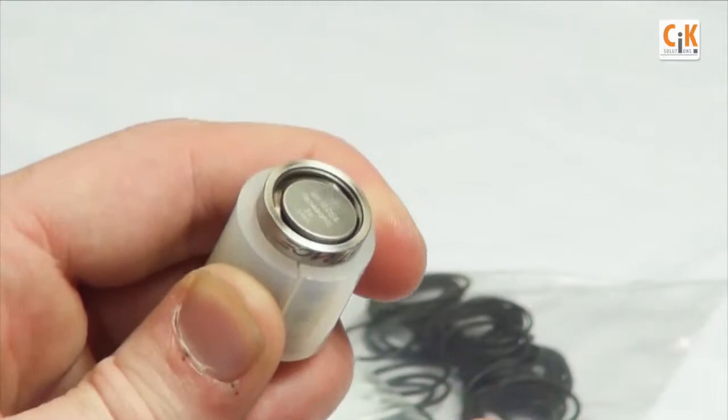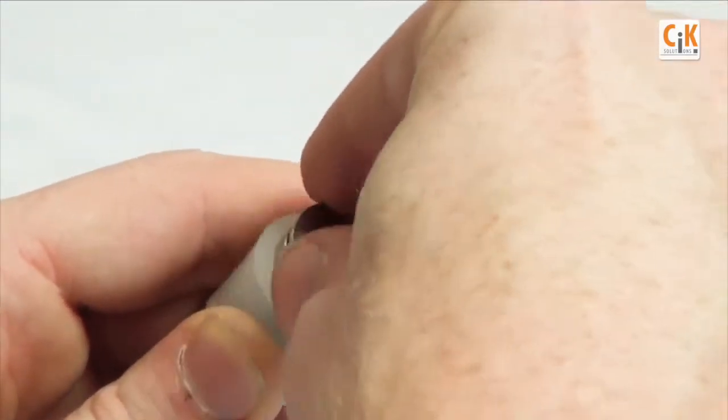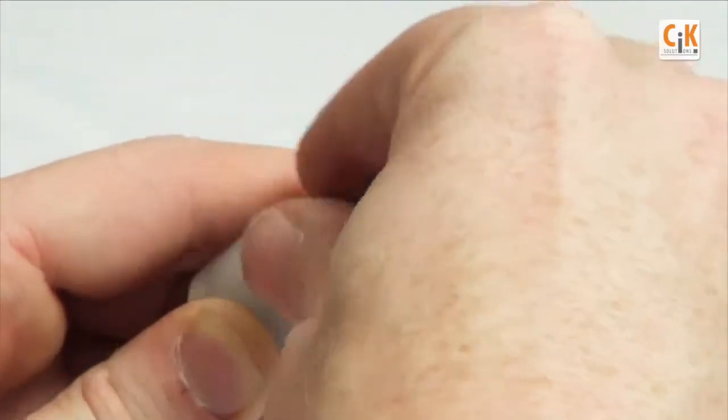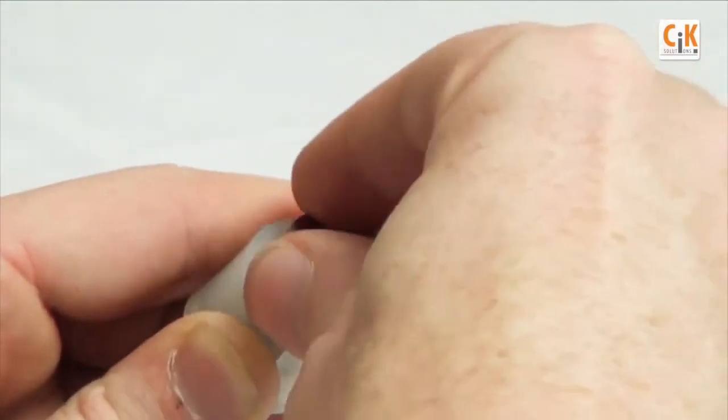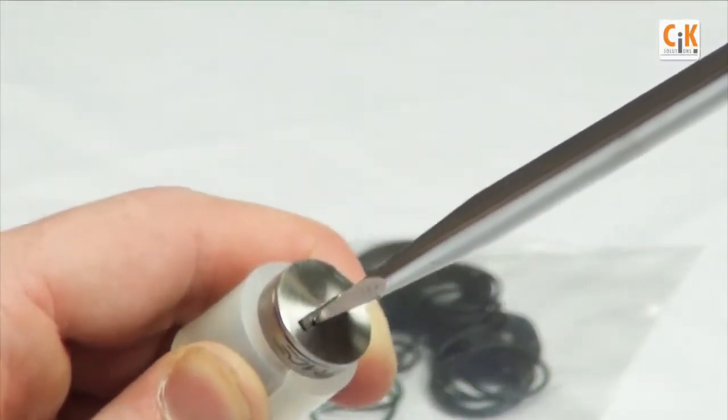Install the battery cap in the reverse of removal. Tighten the cap using a coin or flathead screwdriver until snug.